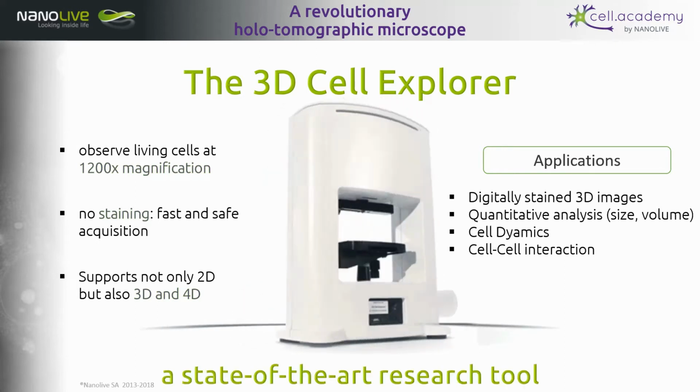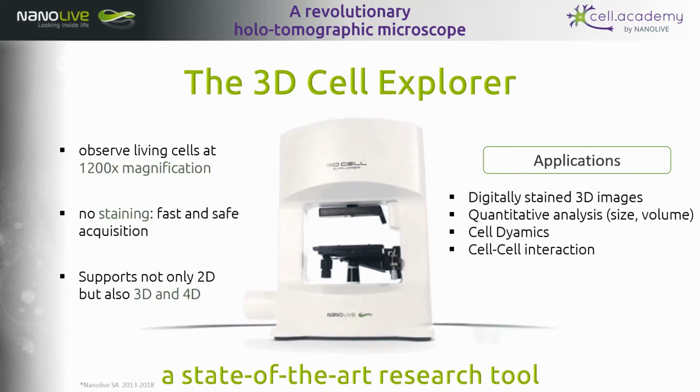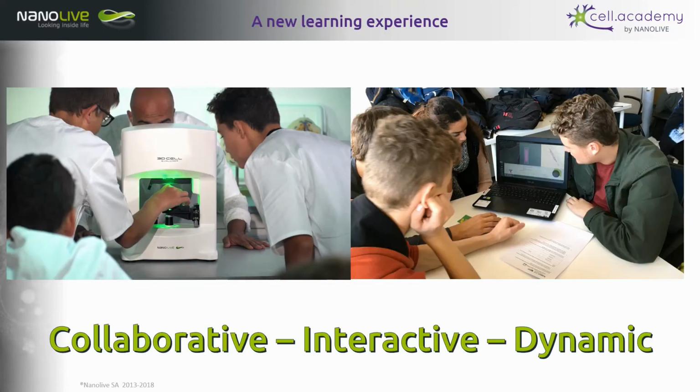Moreover, this is a state-of-the-art research tool. It's being used in laboratories worldwide. And this is great to encourage and prepare students for the research tools that they may be using in the future. And of course, it gets them excited about pursuing careers in science as well. So by incorporating the 3D Cell Explorer in classrooms, it provides a more collaborative approach to learning cell biology, as the students can interact with the data and work in teams. And it provides a dynamic learning environment for the students. They also relate more to digital tools, given that they grow up with them, so it's definitely more exciting for them to work with computers.